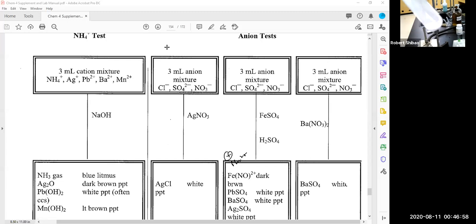And so what I'm going to do is test it with more HCl to see if I can get some more precipitate, because I've got to make sure all the silver precipitated. So let me get the HCl going here. And I'm going to watch this carefully. I want to see if I get more cloudy precipitate. If I get more cloudy precipitate, then that means I haven't precipitated out all my silver. And so I just see turbidity when it goes down. I don't see any more precipitate.